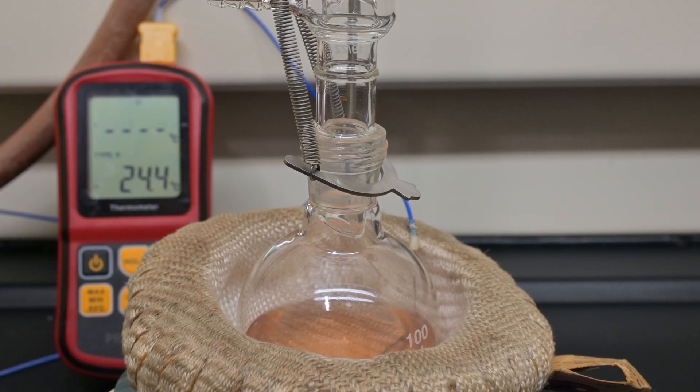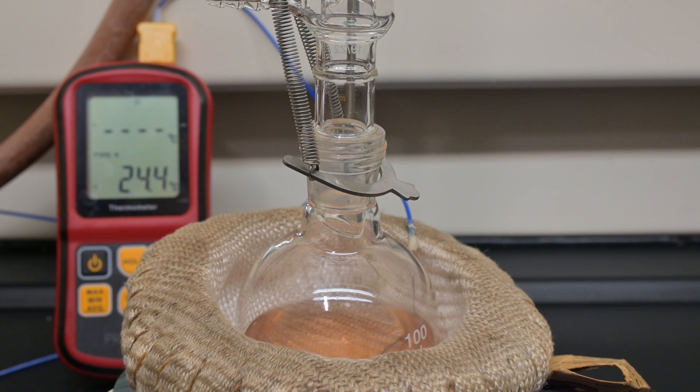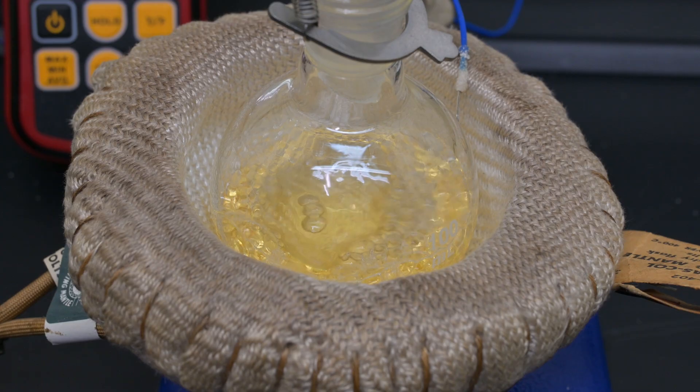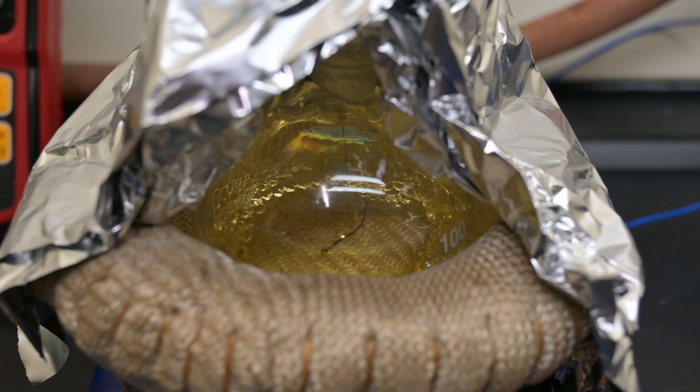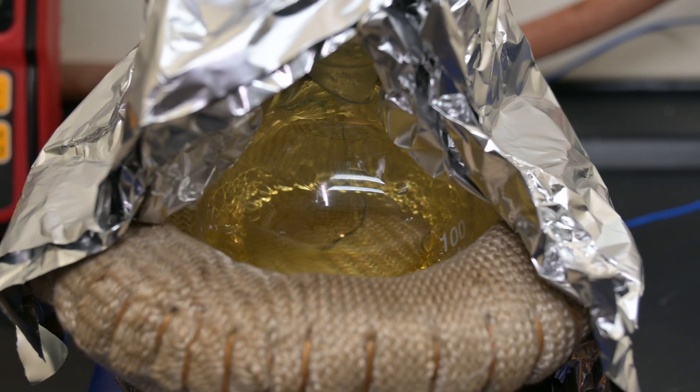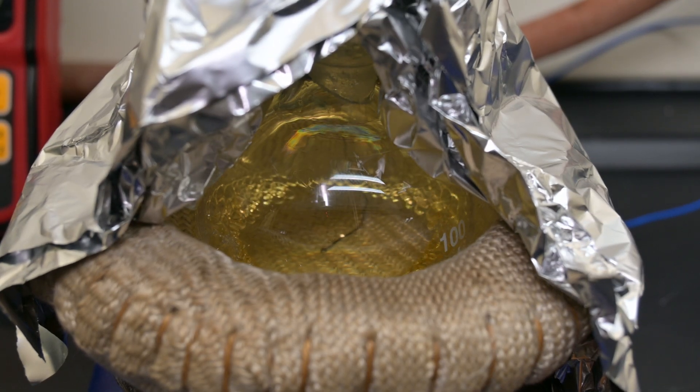The mantle temperature was ramped up slowly. Material started working its way up the column. Material started coming over below the temperature at which styrene comes over, but rose quickly. The flask was switched out and the product was then collected.